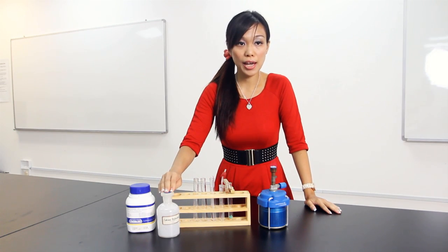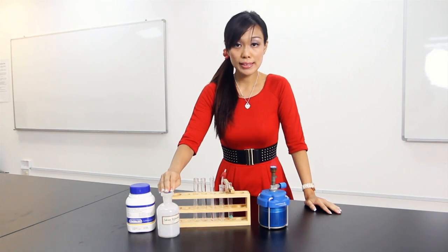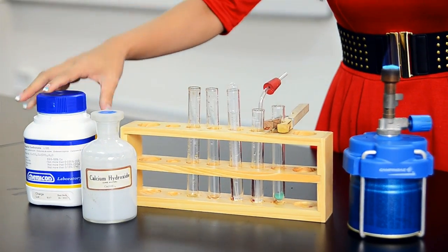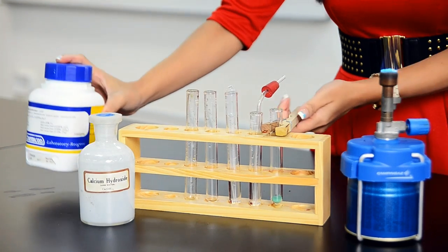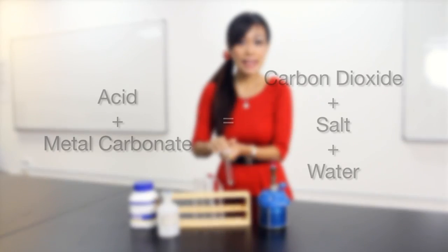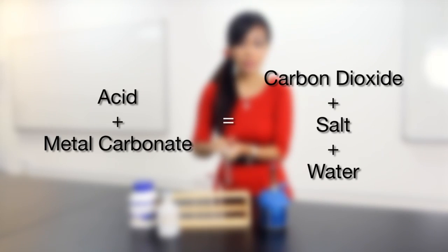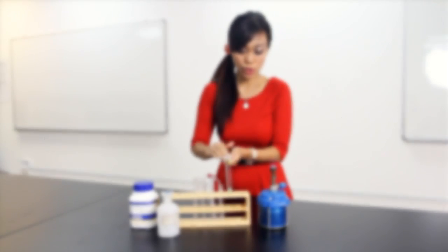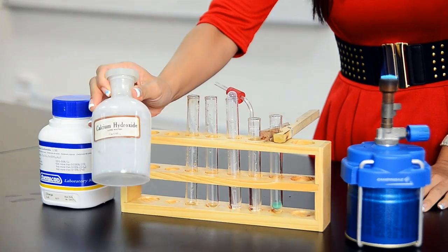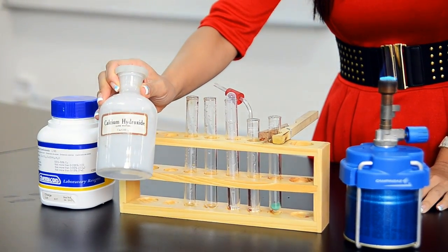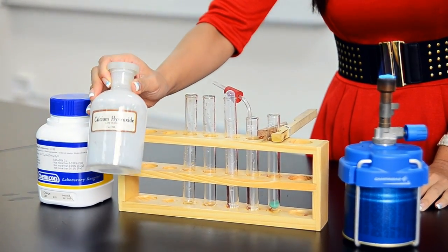A very important chemical reaction for acid is when acid reacts with metal carbonate. What I have with me here is copper carbonate — it's green in colour. When acid plus metal carbonate react, you will have carbon dioxide, salt and water produced. When carbon dioxide reacts with lime water, which is calcium hydroxide, you will see a white precipitate form.